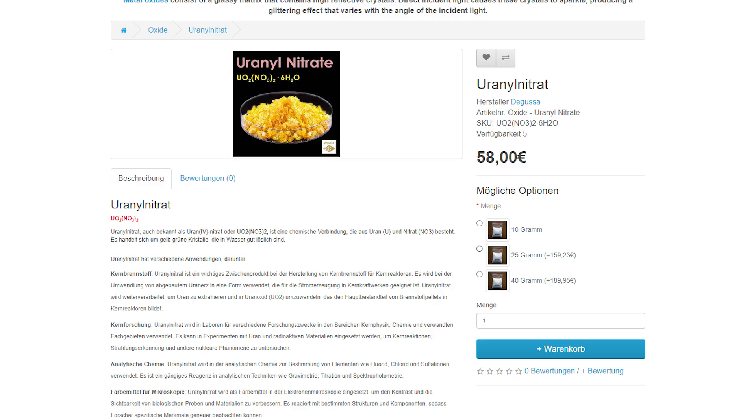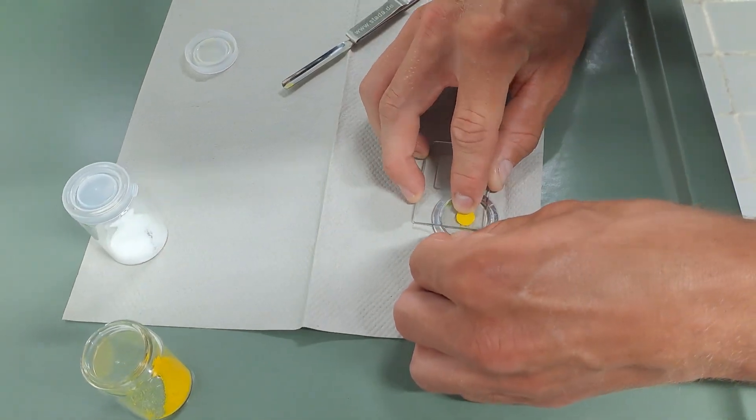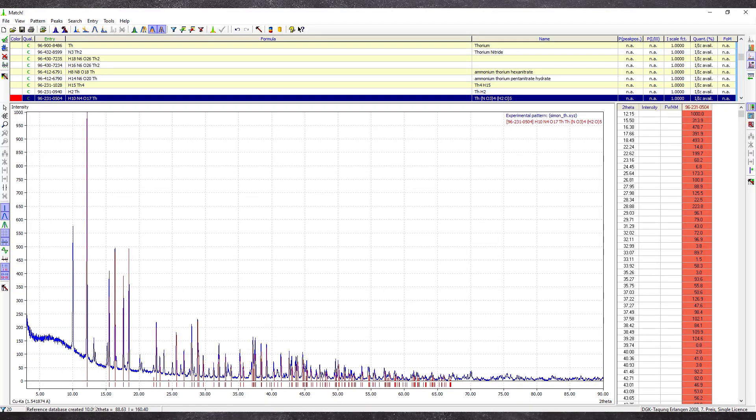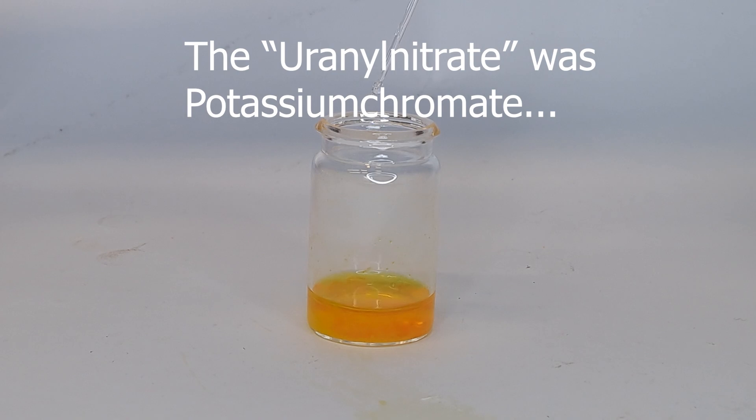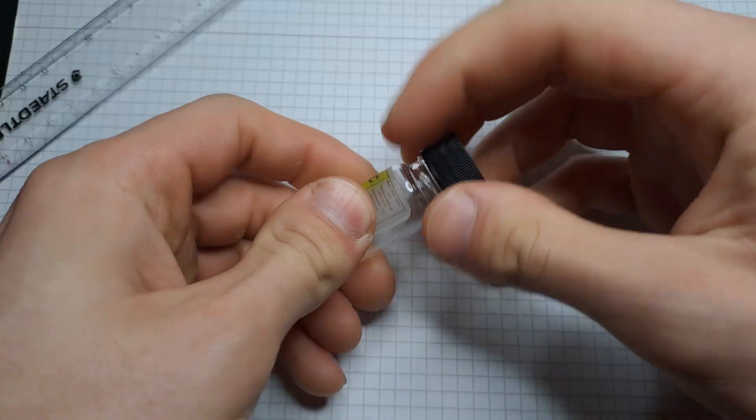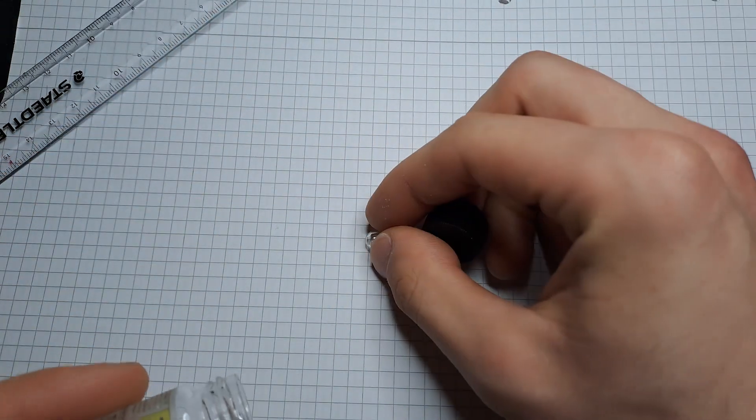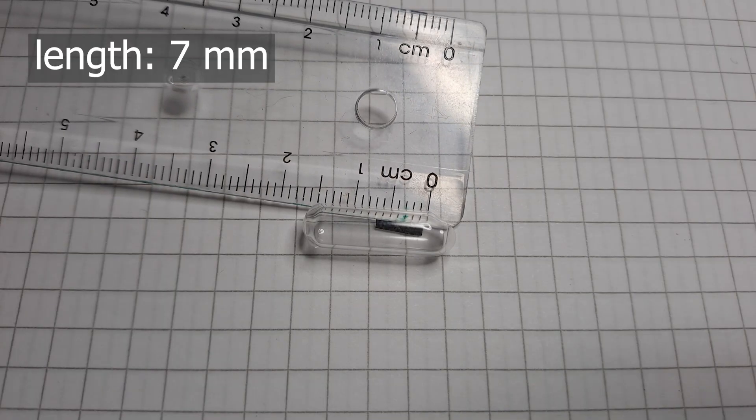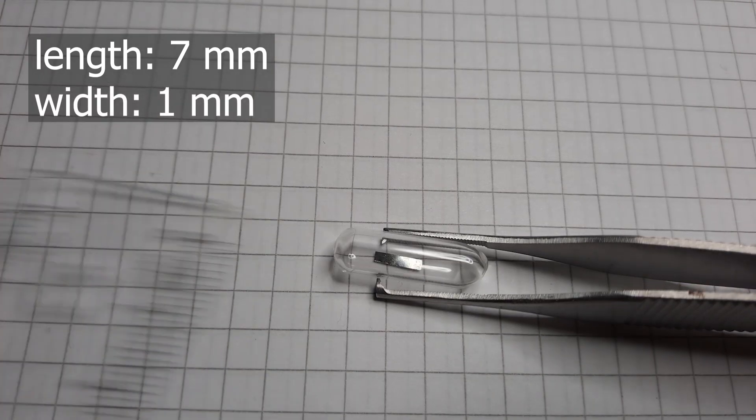As you've learned from another video of mine, caution is especially necessary when dealing with such exotic elements. Fortunately, I work in a nuclear chemistry lab and have the necessary equipment to test this for you. This is the thing, a small strip of silvery gray shiny metal. I cleared everything with Onyxmet, so this is now the official analysis for this sample.